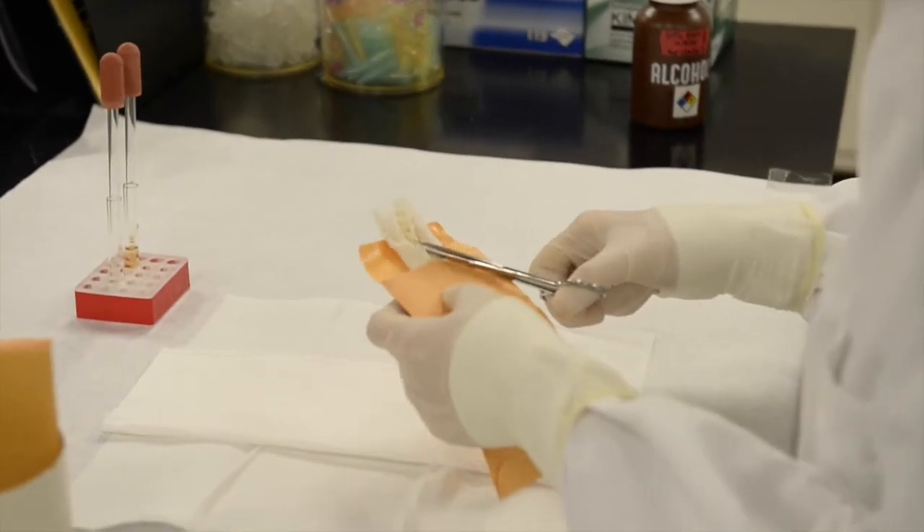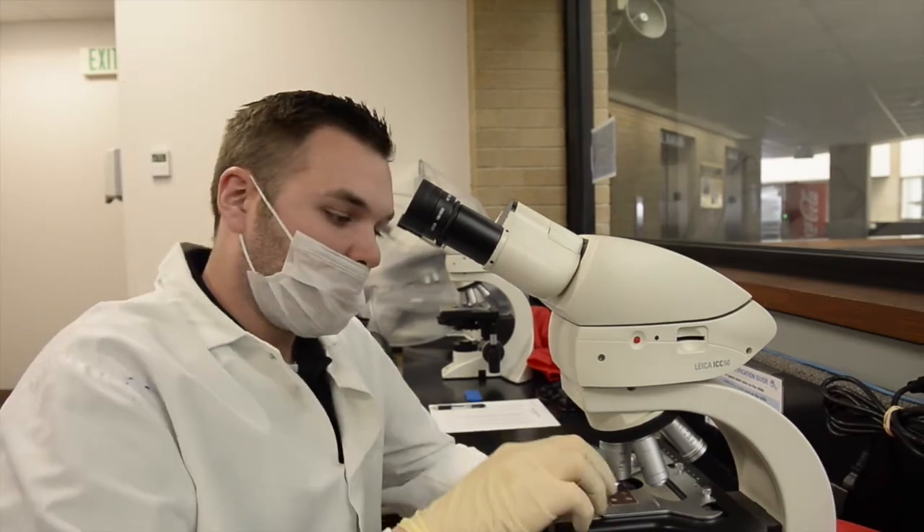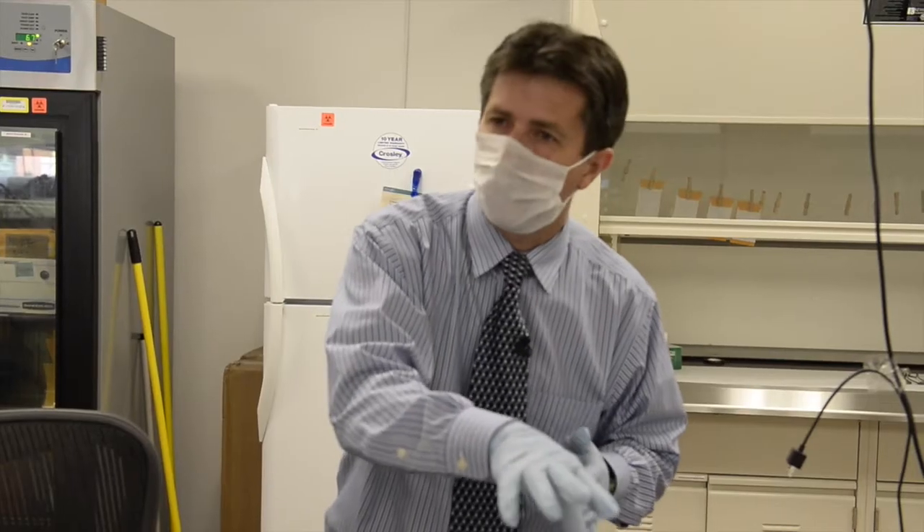She took her swab — it was a positive presumptive test — so you put that into a separate little testing tube, and then we take it over and use what's called the Christmas tree stain. It's basically just a two-step staining process with a red and a green dye. So we're looking for the sperm heads. This is kind of getting it ready for DNA.